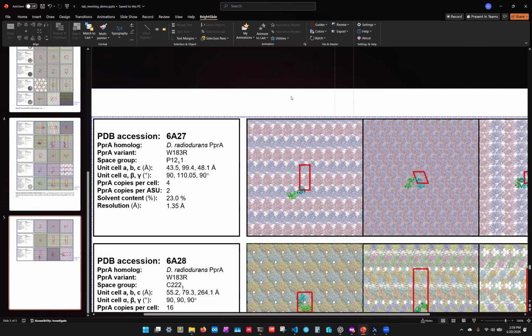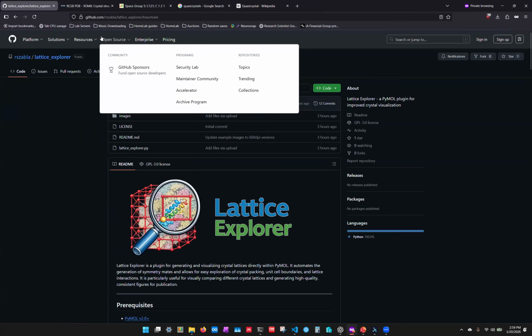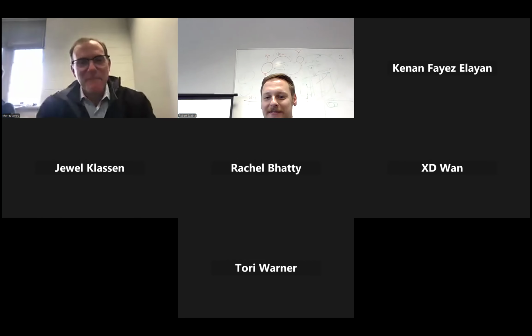So that's pretty much it. I could send everyone this link if you want to play around with it. I apologize, I've only tested this on Windows. I haven't tested it on Mac or Linux yet, so if it doesn't work on Mac, let me know and I'll play around with it. You can also just do this on our Windows server through NoMachine. Feel free. One of these days I have to figure that out before Rob graduates. That's so cool.